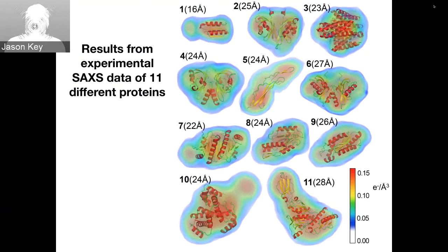They would be able to take all of their images and produce some sort of spherically averaged scattering data and then somehow devise an envelope that they could see, like, oh, I've got a domain over here.